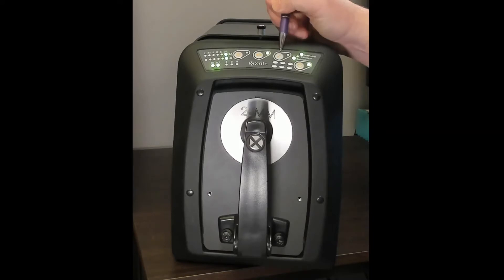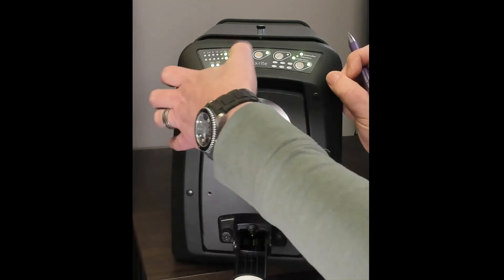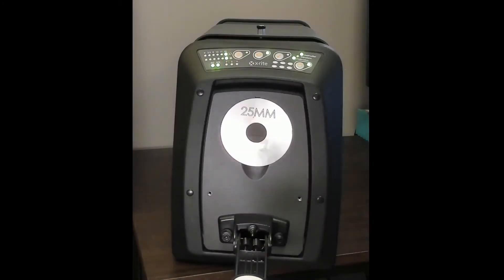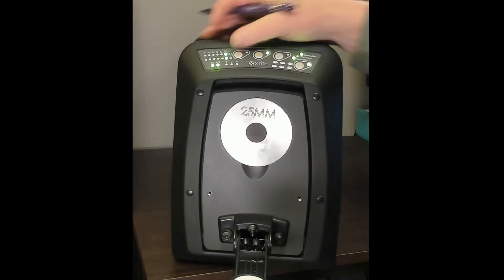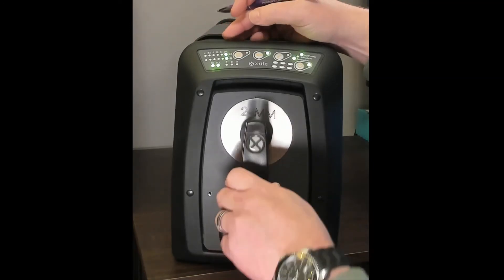The three buttons across the top: the middle button controls the video preview — the camera inside the device showing you what you're going to measure. The button that looks like a target triggers a reading or the creation of a new standard. The button that looks like an arrow triggers the creation of a new trial. These buttons are useful when you have a very large sample — where the arm might be pulled down and you need both hands to hold the sample — so you can trigger a reading without needing a free hand to interact with the software.